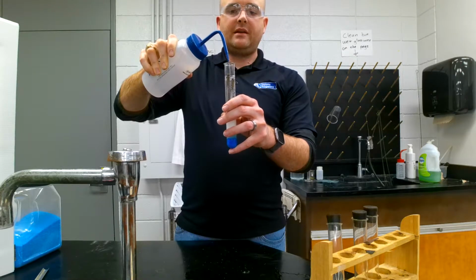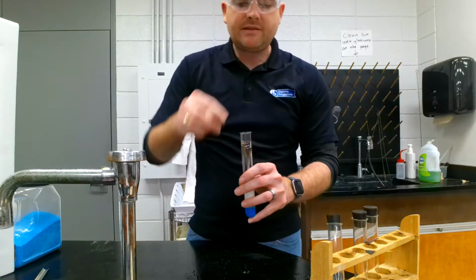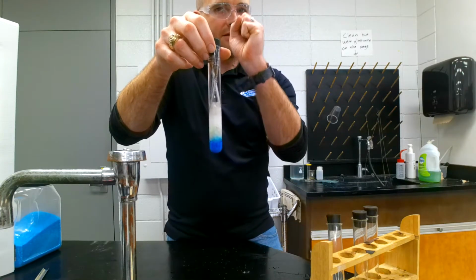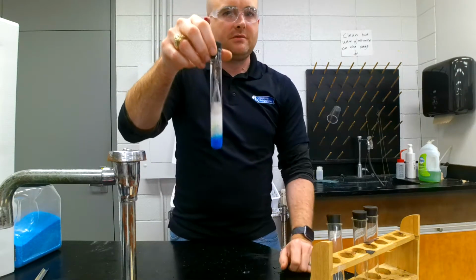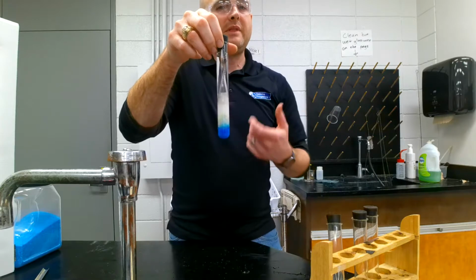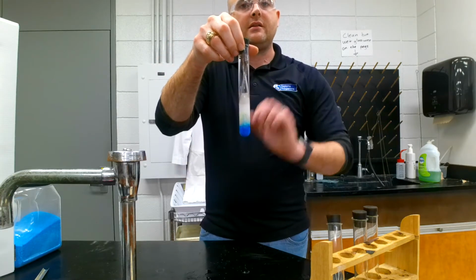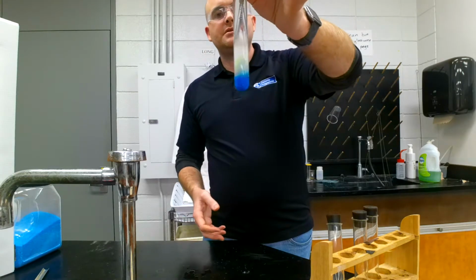Now what you should be thinking of is something on the particle level. Remember, that's what we're trying to get to. Remember this solid right here, this iron is a solid, so all the particles are really close together, really tightly packed. And now this copper sulfate eventually is supposed to dissolve, right? And it'll make this blue solution. So what would that look like on the particle level? Remember, those copper ions now are going to be floating around in solution. Now that electrolyte, what's that going to do? Well, maybe it will help conduct the charge. So we're going to let that sit.